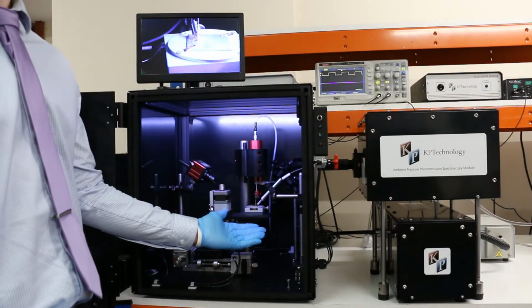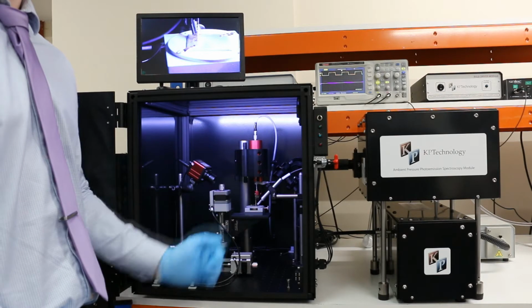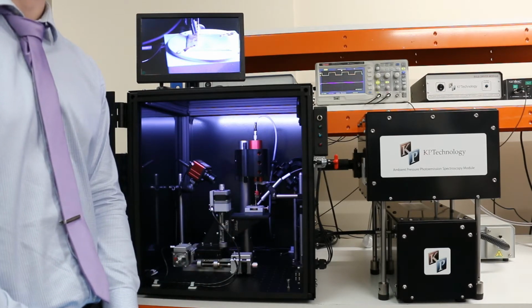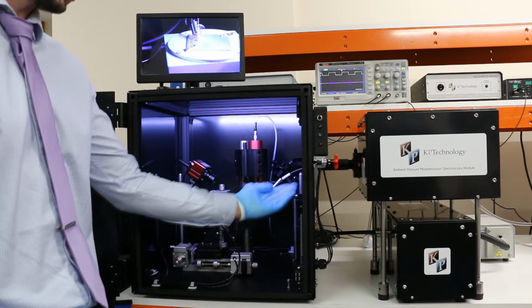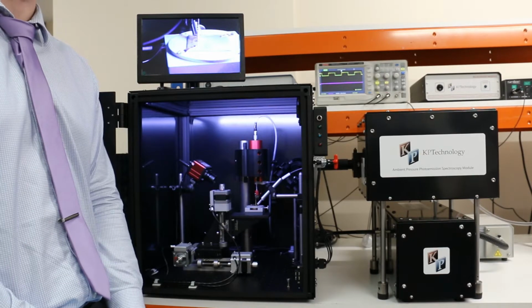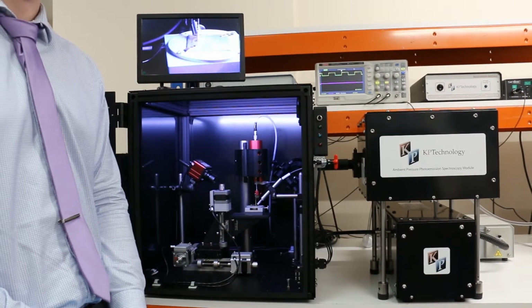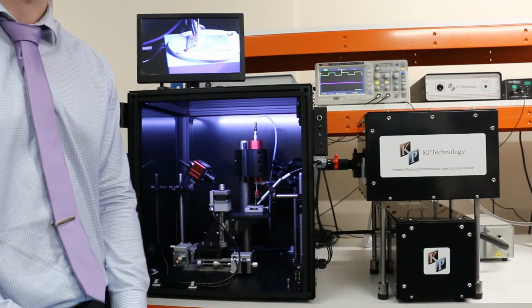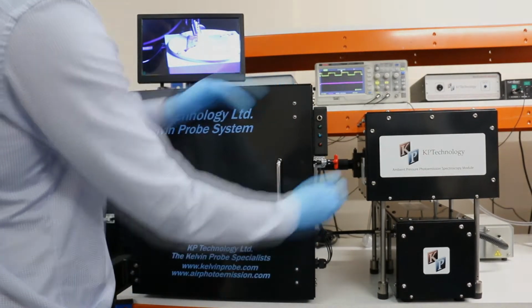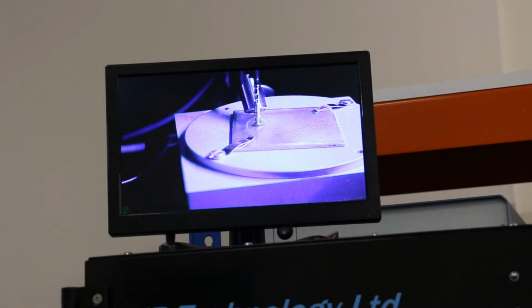The system has been optimally configured with the Kelvin probe tip over the area of the sample to be investigated at gradient 300. The light from the UV fibre is illuminating the sample under the Kelvin probe tip. At this point, we can now shut the door, critically with the toggle clamp engaged. The sample targeting LED can be used to check our alignment with the enclosure LED turned off.